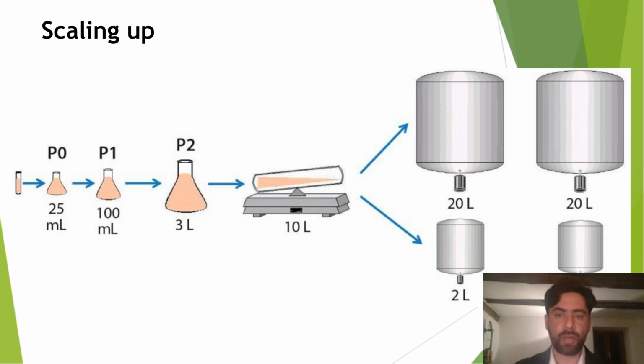And that is especially important then, because you are not going on with only a single clone, but you actually pick up 5 to 6 or 7 clones, which are the most promising clones. So at the end, if there is anything happening, which would happen in most of the cases anyways, then you have the opportunity to actually pick up another clone, which would be the best one.